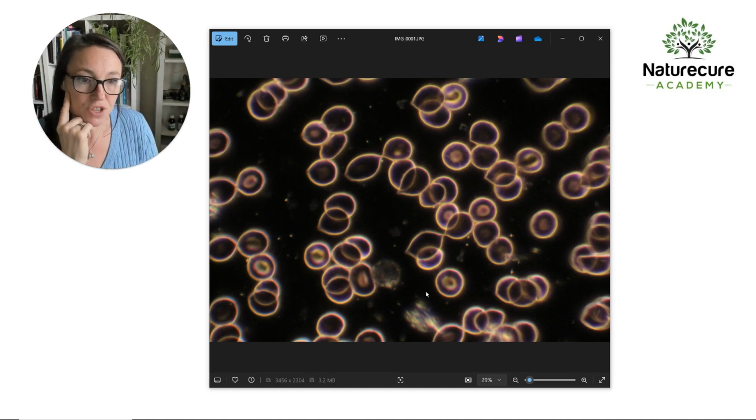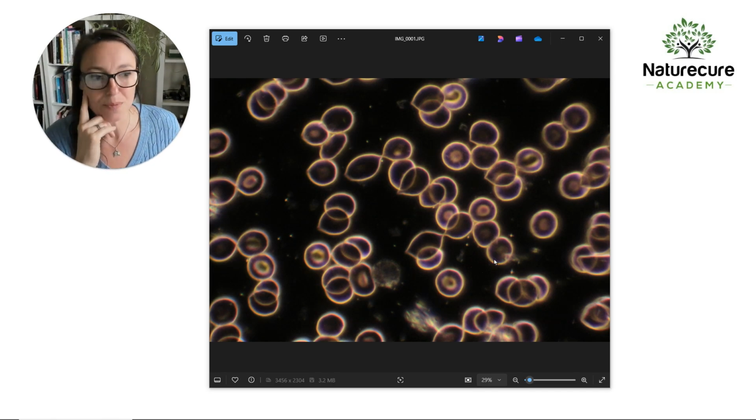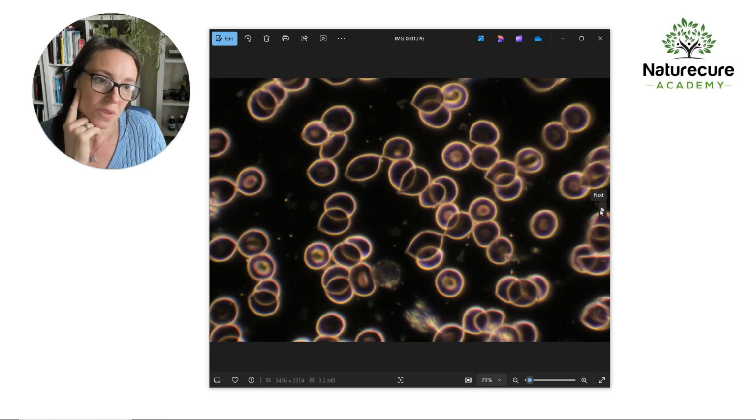So here I am just going to quickly go through some of these images.